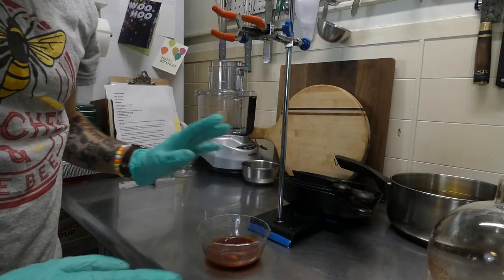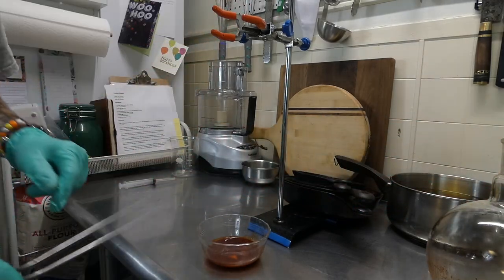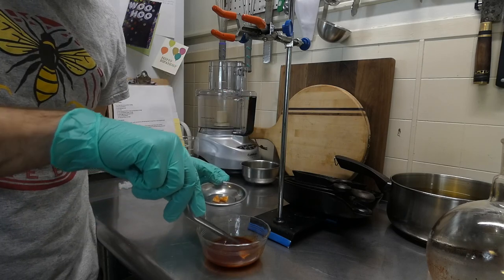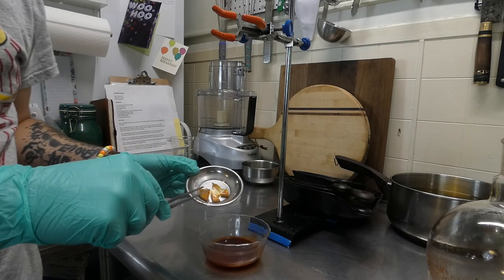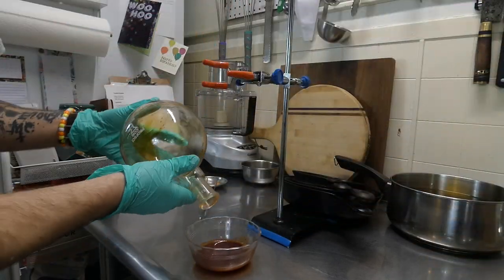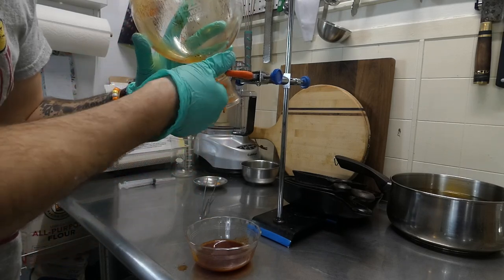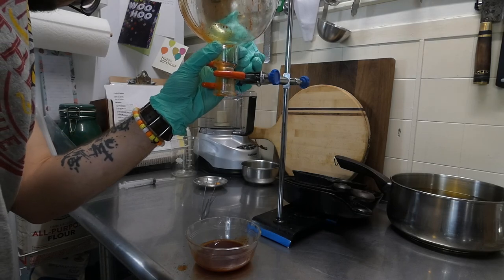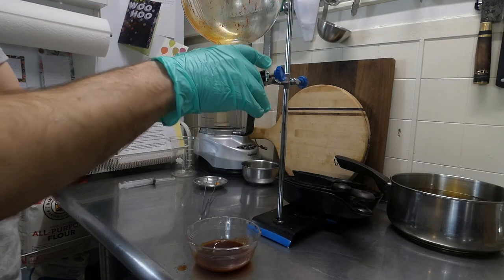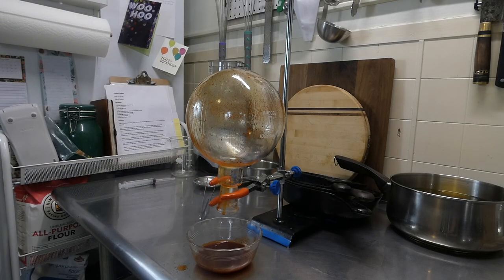Okay, now that my gloves are back on, we're first going to fish out the boiling chips that were in here. We're going to lose a little bit of oil on here, but that's not a big deal to me. Now we're going to turn this upside down and let it drip out. Oh, just lost some. You can definitely smell the peppers. It's not unpleasant, so that's a positive. We'll let that drip for a little bit and we'll come back.